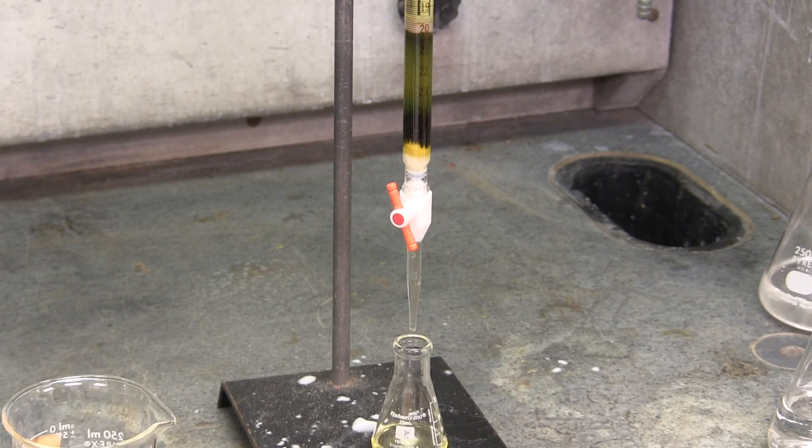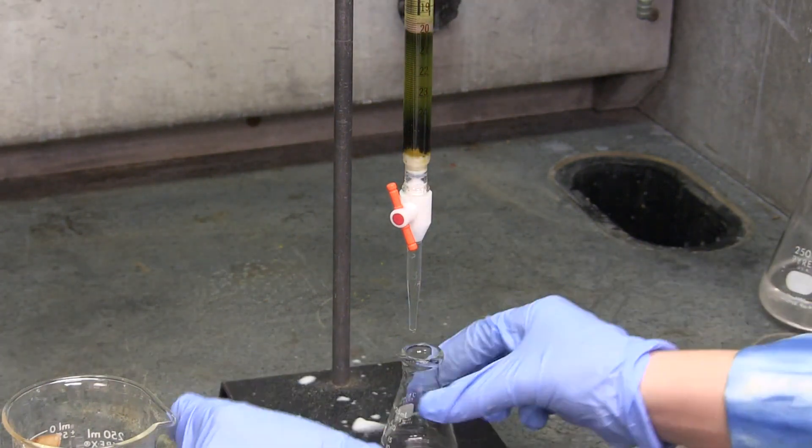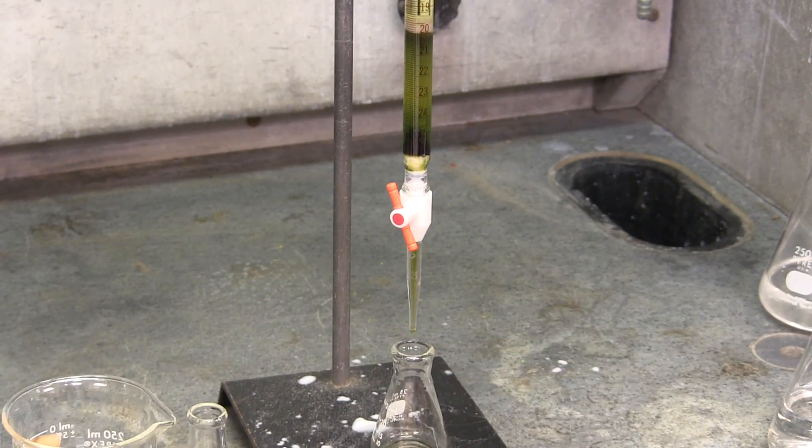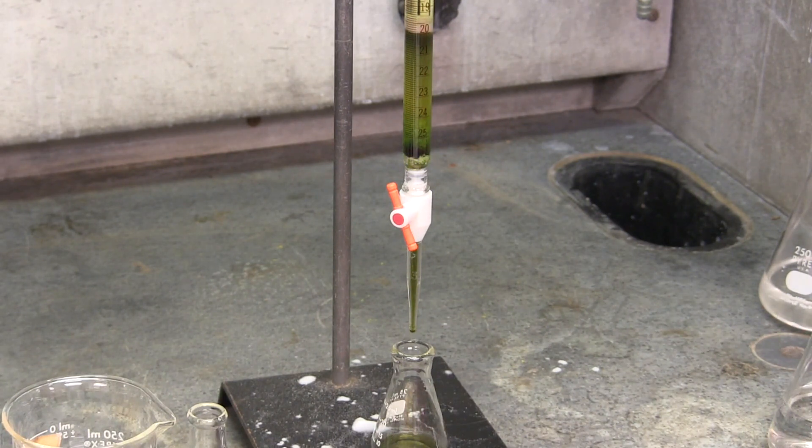As the yellow band approaches the end of the burette, you may switch Erlenmeyer flasks to collect the transitions between the bands. The next fraction collected in a new Erlenmeyer flask is the dark green band.